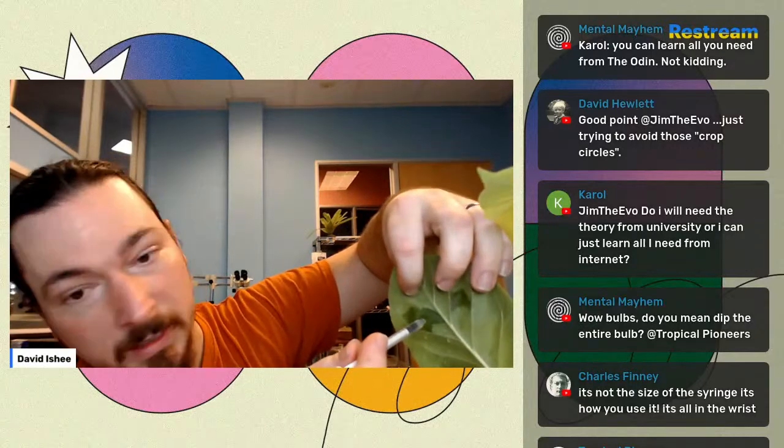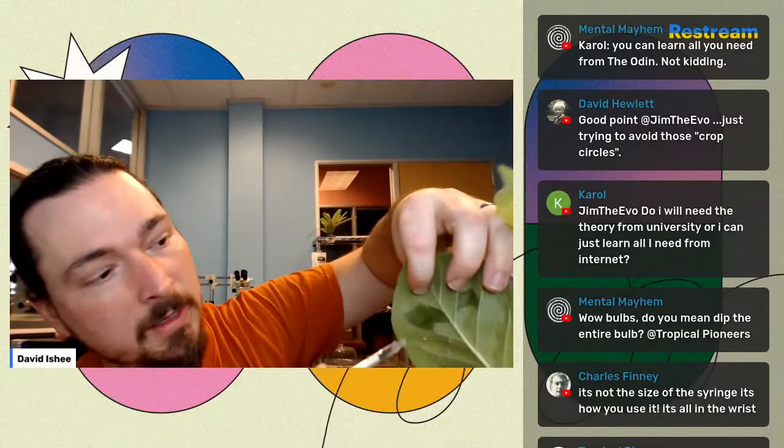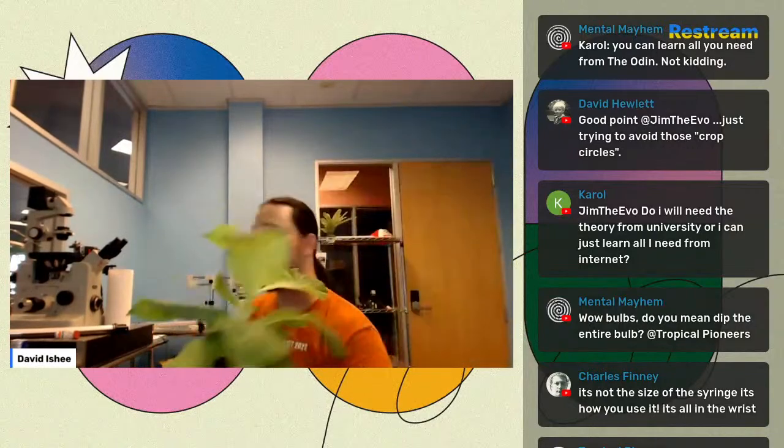And you can get a pretty big space. You can see how much of that is from one injection. You just stick it in there and let it spread. If you wanted to do half a leaf or the whole leaf, maybe 10 total injections. And if your pressure's a little high, you'll get a couple of circles, but the majority of it will be modified. So if you're trying to make something decorative, you can do it with minimal damage.